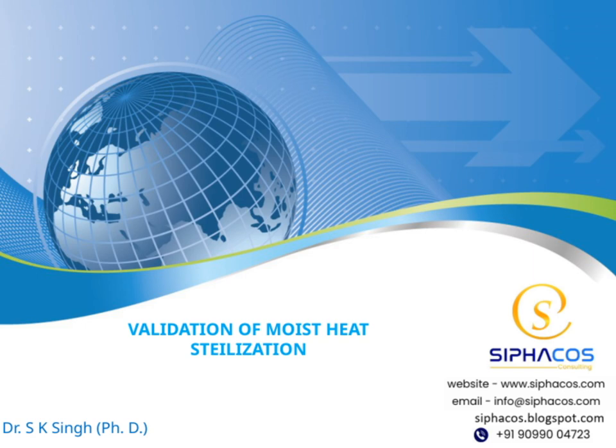We will be discussing the validation of moist heat sterilization, a crucial process in ensuring safety and efficacy. The presentation is titled Validation of Moist Heat Sterilization, and it is presented by Dr. S.K. Singh, PhD. I'll be guiding you through the key concepts, methods, and standards involved in this important area. Over the next few slides, we'll cover the principles, procedures, and best practices to ensure effective sterilization. Let's get started.